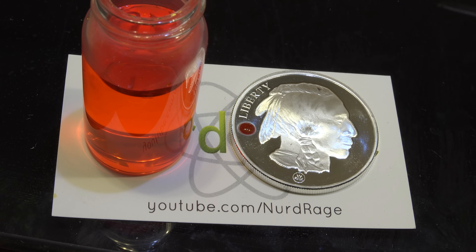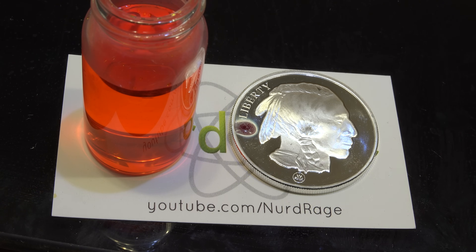Greetings fellow nerds. In this video we're going to make a silver testing solution to determine the authenticity of silver metal. This is the same solution sold commercially and online, and we're going to reproduce it here as well as explore the chemistry.